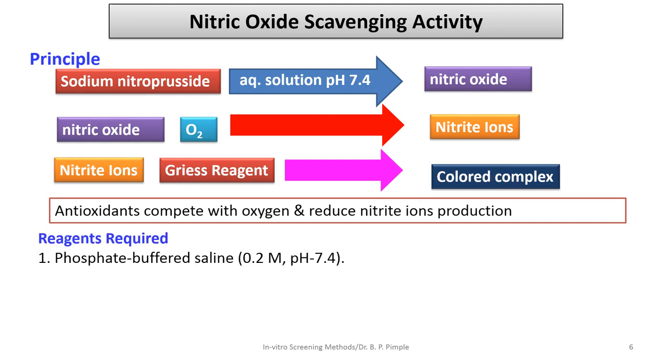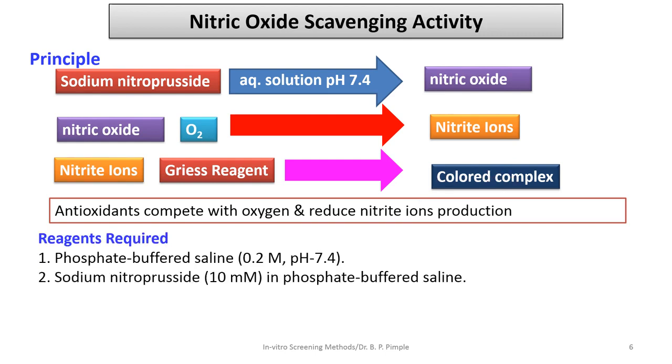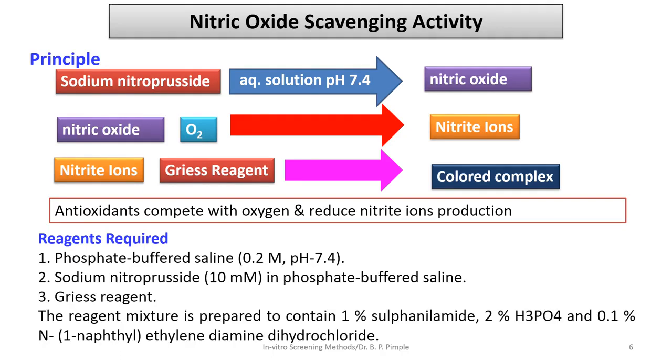The reagents required are phosphate buffer solution, sodium nitroprusside, and Griess reagent. Now, Griess reagent involves sulfanilamide, phosphoric acid, and that inactive dye, that is N1-naphthylethylenediamine dihydrochloride.